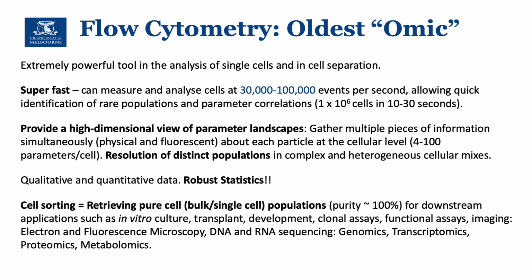The other thing is that cytometry provides measurements at a high dimensional level. So you measure not only one property, but several properties at once out of each individual cell. And you can resolve different subsets out of complex mixtures, and you can essentially do correlation between, imagine, treatment of the animals and the evolution of cytometry subsets in the immunological system, etc. You can do all this level of expression, timing, kinetics. It's quite powerful in terms of the information that it provides.